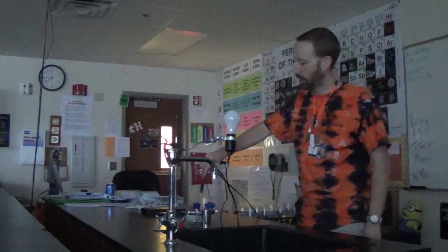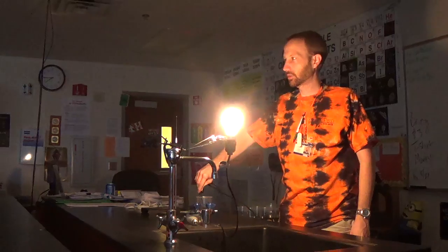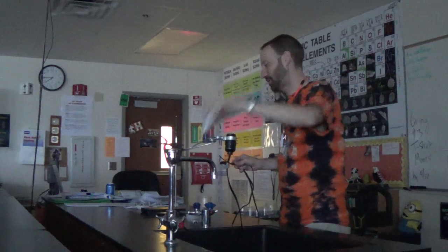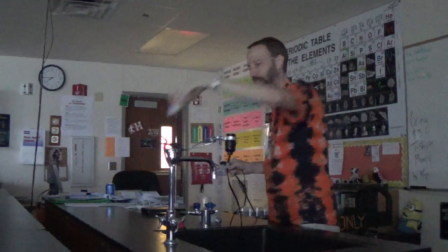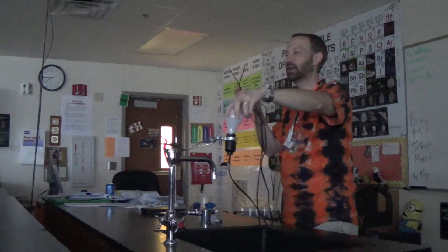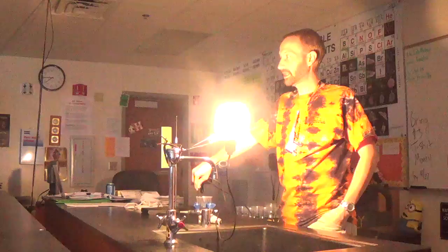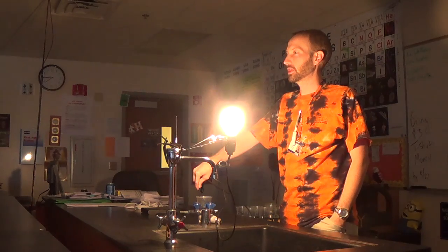So there's my 34 watt light, and here it is in hydrochloric acid. Why did it pop? It's really strong. Okay, so here's my 100 watt light bulb. And keep in mind, the way I'm holding the wires puts them on pretty much the opposite ends of the cup. It is that strong that we get that spark as it enters.